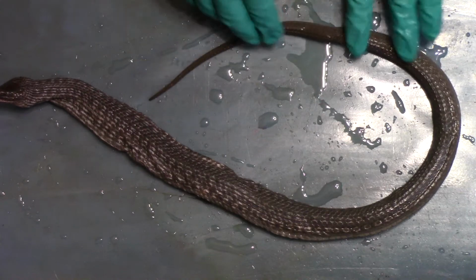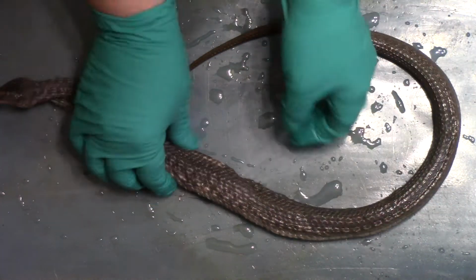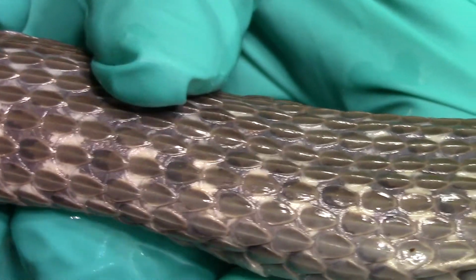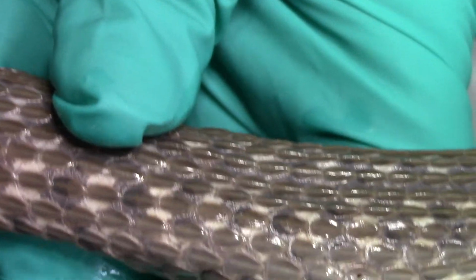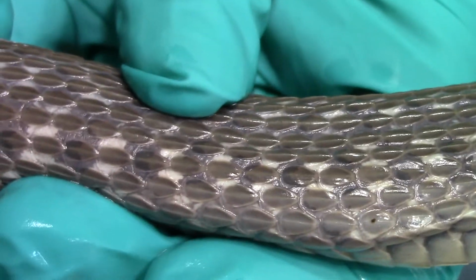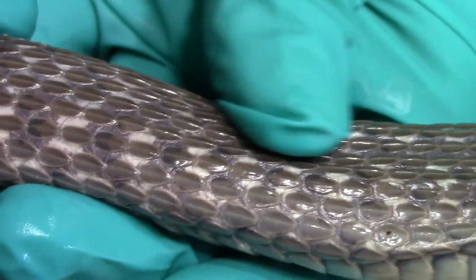And then from the top, they're pretty much the same. Depending on the snake, you might see different patterns on their scales. These scales are keeled. There's a line running down the middle of each one, gives it a rough shape. Many snakes don't have keels, so for example, the smooth green snake that is native to Ontario is called smooth because of its smooth scales.